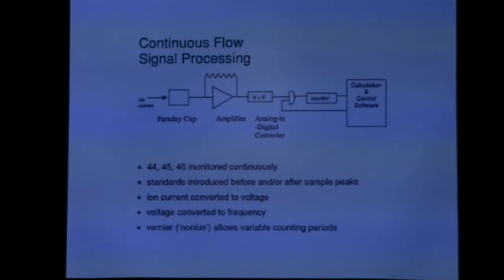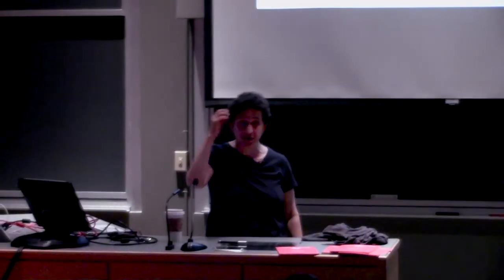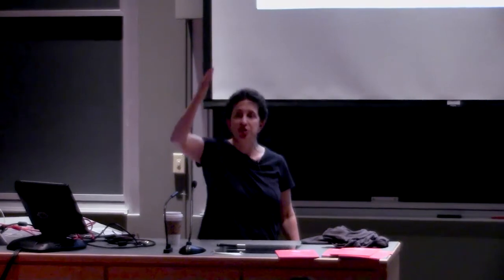We're actually now working with much shorter time periods. We're working with 50 hertz in some of the new work that we're doing. But that slice of time captures a bit of your signal. And remember, your signal is constantly changing because you're working with peaks and valleys. And so you have to think about the integration period that will best capture that variation in a meaningful way. So that's one of the changes that's happening.